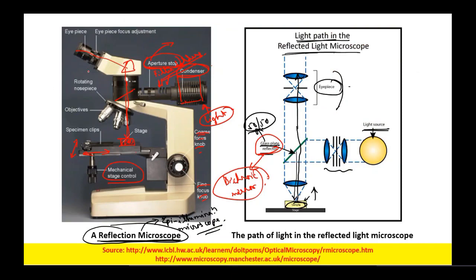Again, for imaging purposes, if you see, it is a binocular microscope. So you can move this eyepiece and you can attach the CMOS cameras for the imaging purpose.